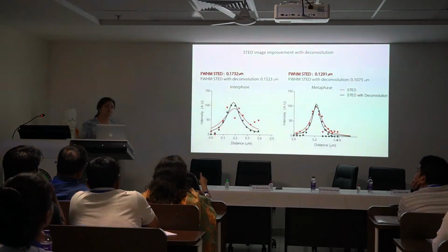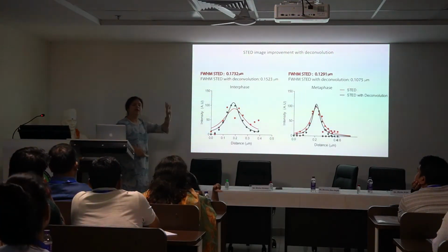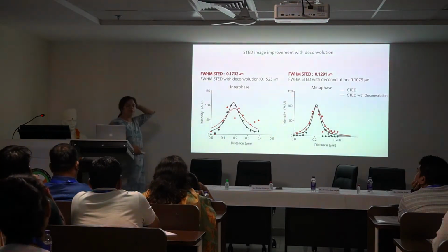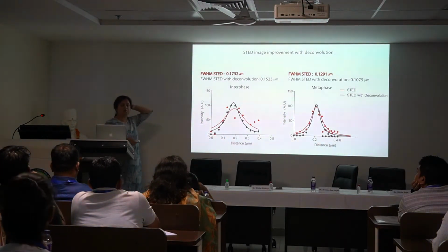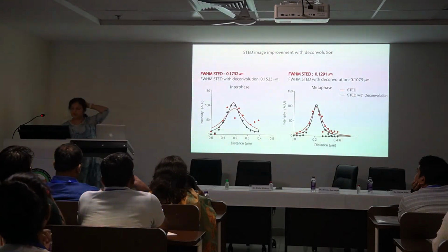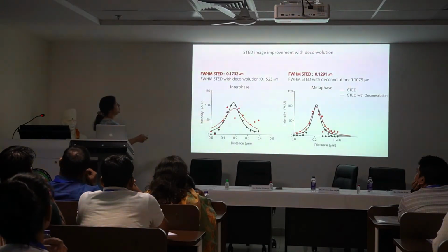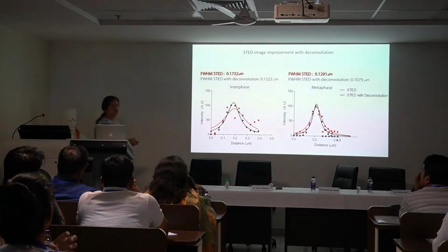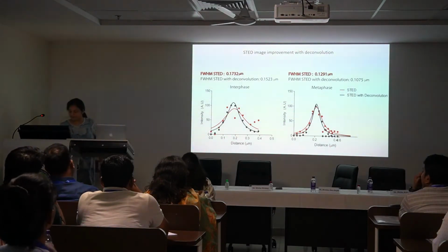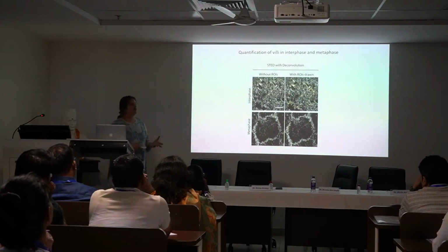Making this at the STED confocal, like how you? Yes. So we take the STED image, and there is a way of doing it at the microscope itself, right? So that is something which will improve the resolution even more. In fact, it's recommended for most applications that we take the STED image and then run it through deconvolution. Got it. Yes. Okay, so then we want to know something more quantitative about the system.